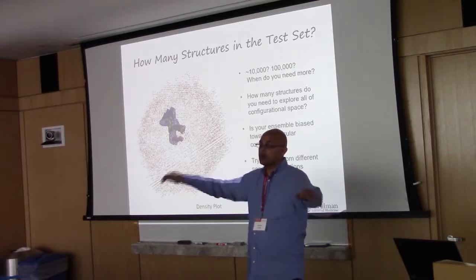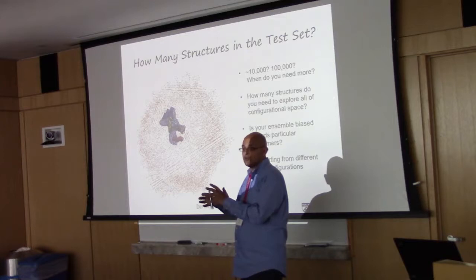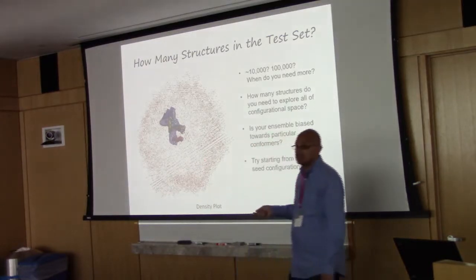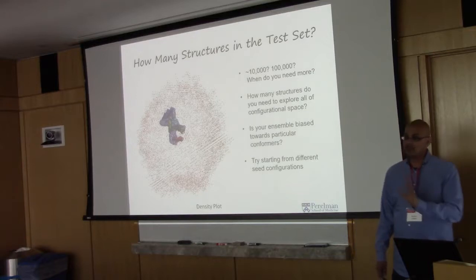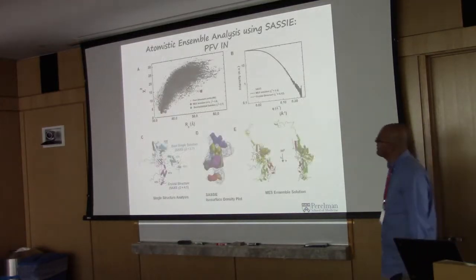Sometimes you might reach out only once, where some solutions are conformers or oversampled and overly represented in your test set. This is also a stage where you can put in decoys, put in the BSA molecule or something, just to make sure that you're not finding anything that fits that's actually specific to your molecule. All right, so this was the results of our analysis.